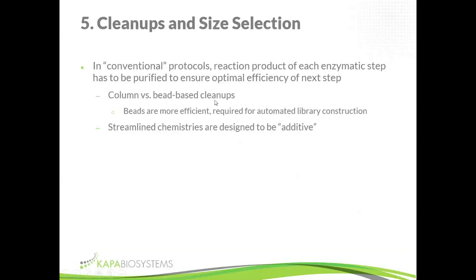With the streamlined chemistries, obviously they're designed to be additive, so you don't have to do any cleanup after independent steps. A-tailing is one reaction anyway, with no cleanup before ligation. And so with the streamlined protocols, your first cleanup is after ligation, and then you have one after amplification. So that's just part of the streamlining and the efficiency of these protocols. Part of the higher recovery is just because there are so many fewer handling steps involved.